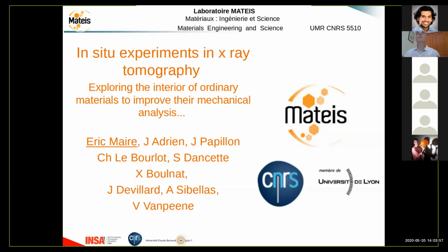So I will speak about in-situ experiments in X-ray tomography. There is a subtitle to this talk: exploring the interior of ordinary materials to improve their mechanical analysis. It's been a long time that I am using this technique, in-situ experiments in tomography. So I have many different types of examples, old examples, more recent examples.